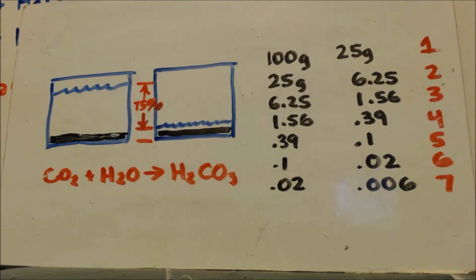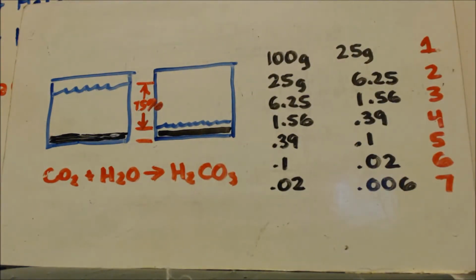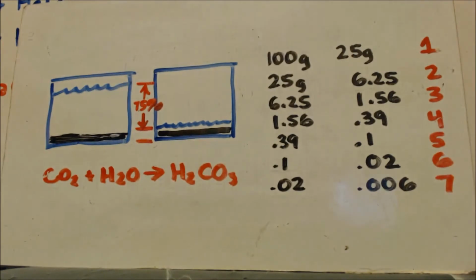hydroxide. So I fill that up and I siphon it out, fill it up, siphon it out. I do that like 5 or 6 times, or how many times I want. And during that time, because it takes so long for it to settle, the carbon dioxide goes in and out of the water, and it basically just makes the H2CO3 and converts the hydroxide to the carbonate by the time I'm done, right? Now when I get done doing this 5 or 6 times, I'll let this be wet, and I will just throw it in the oven, or put it on a radiator or whatever, and dry it up.